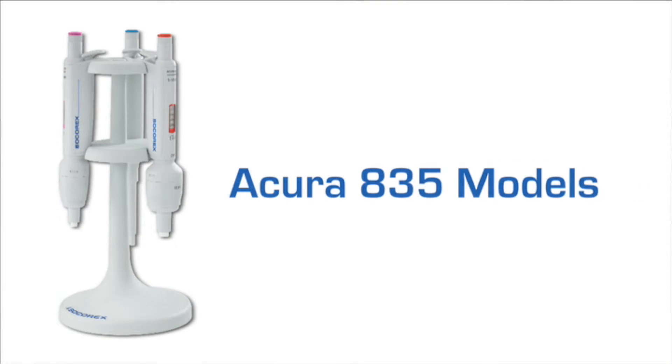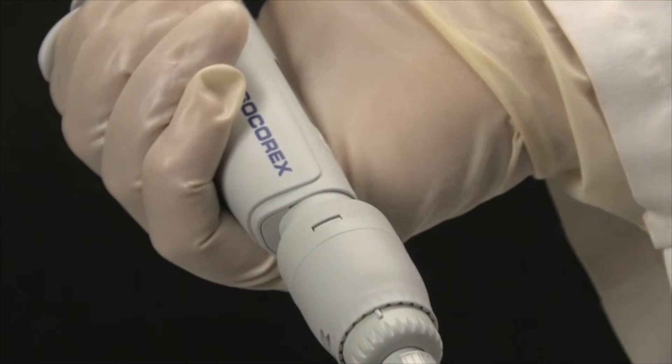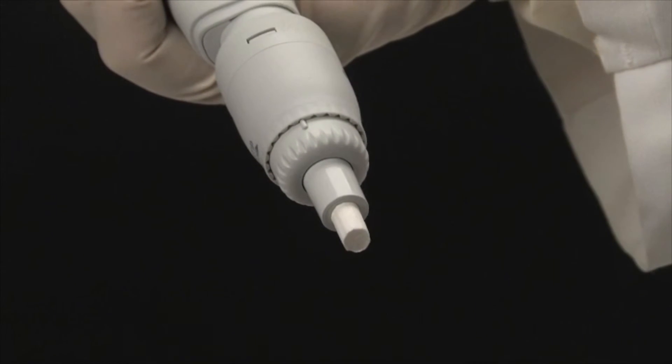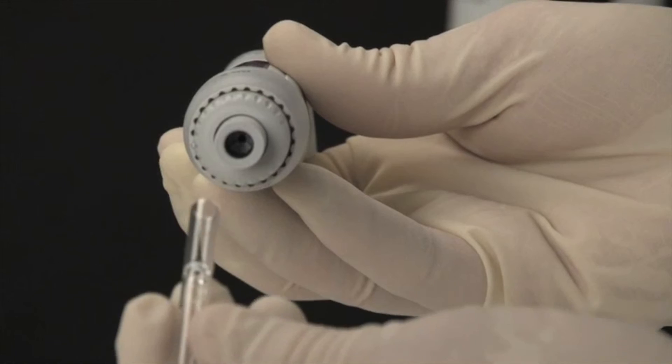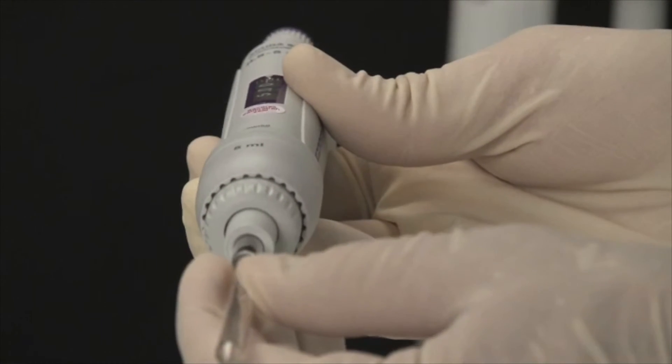The Acura manual 835, which is offered in three sizes for larger samples, can accommodate nozzle filters for added protection against liquid fill and contamination. An optional adapter nozzle allows for the use of Pasteur pipettes on the 2 and 5 milliliter models.